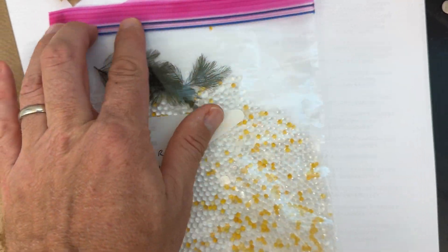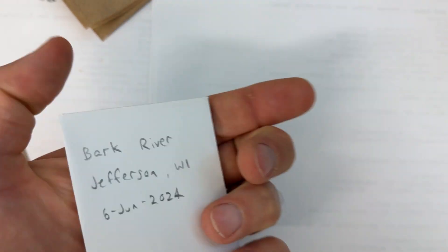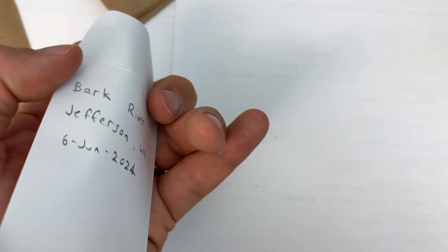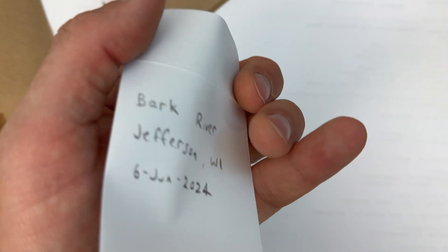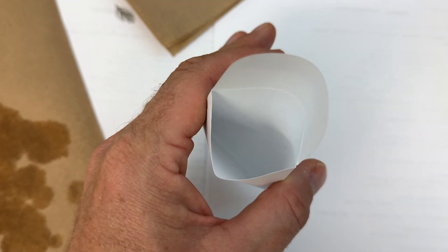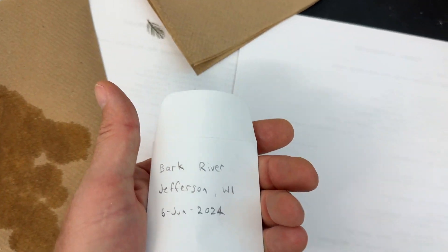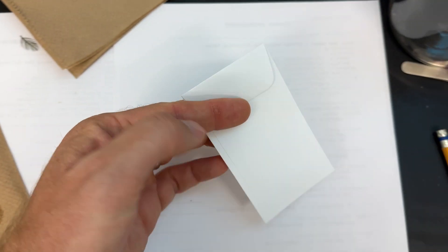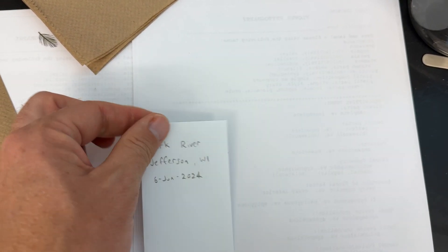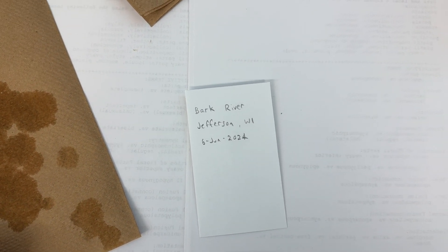Another alternative is to use a paper coin envelope like this one — this kind of protects the material from coming into direct contact with the silica beads and keeps everything in one place. If you have a plant that's more likely to fragment, or you just want to be sure your material stays together, a paper coin envelope is a good option since it's permeable and can still dry out in the desiccant. The alternative would be to take the starting material, blot it, put it into the coin envelope — which also helps press things flat — and then put that into the zip container with the desiccant. And of course, keep everything labeled well so we can match your specimens with the records when they arrive.